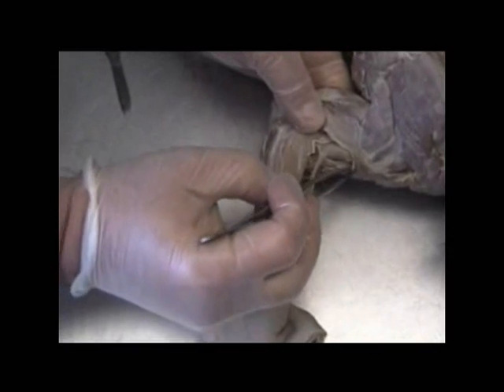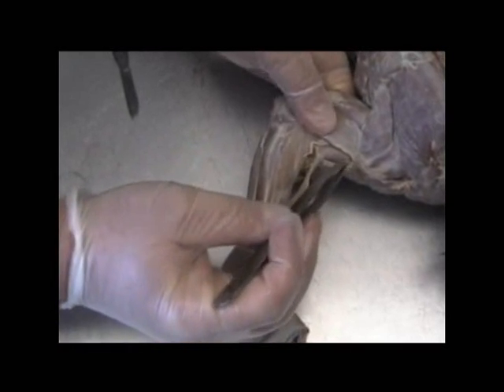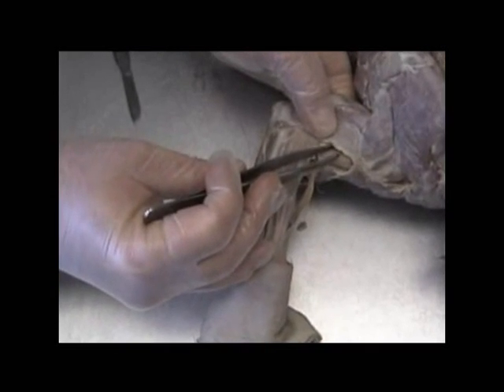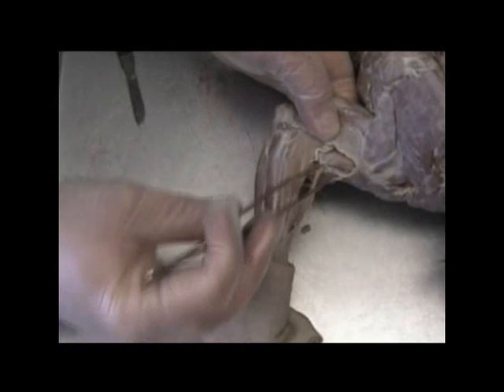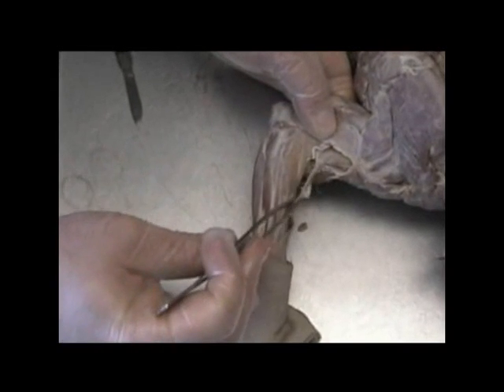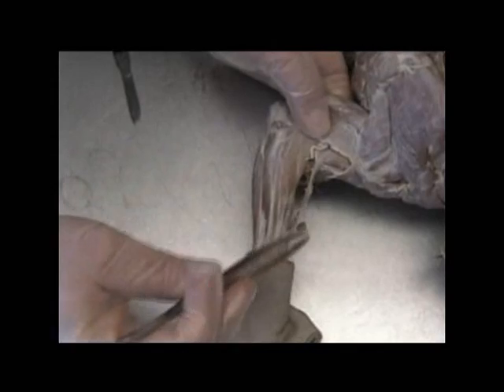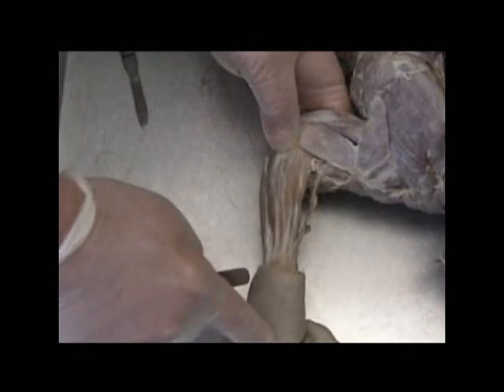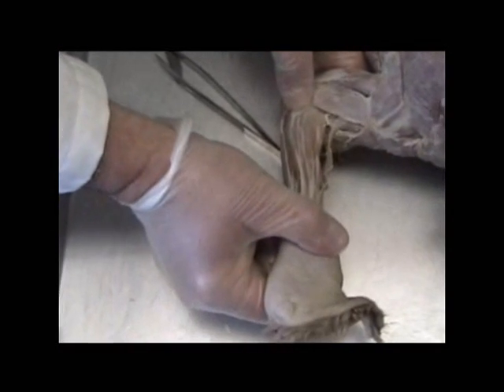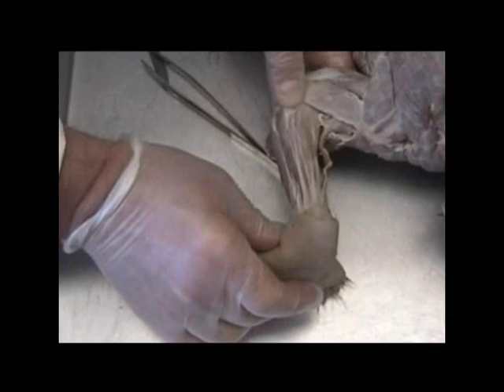If we pull up on the triceps as well and pull down on the deltoid here, we find another bulgy muscle right here. And this muscle is the brachialis. What's a little bit confusing, and it's a little tough to see on this dissection, is there's a muscle that runs right across the top of that, running obliquely or at an angle, coming across the top and running down here, and this is the brachioradialis right here. So brachialis, and coming across the top and running down is the brachioradialis. And again, what we have here are a set of muscles that come down and articulate on the paw, and in this particular case, extend that paw. So we have the extensor group there, and the flexor group antagonistic on the other side.